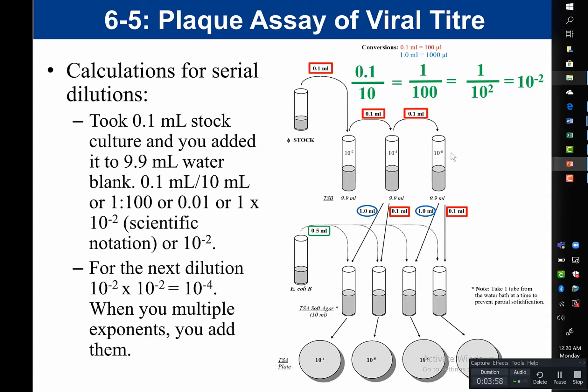If you're struggling with that math, go back and review the video for the standard plate count. I went through this in a lot more detail. Now, remember, this is our virus stock solution. These are my serial dilutions for the virus.